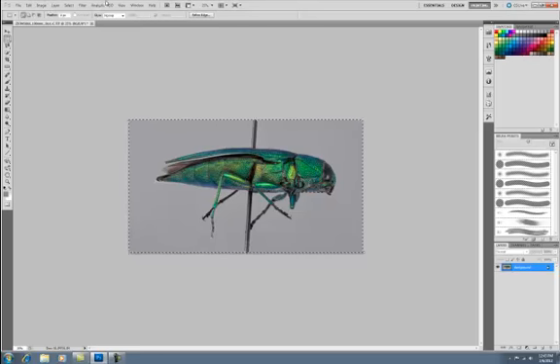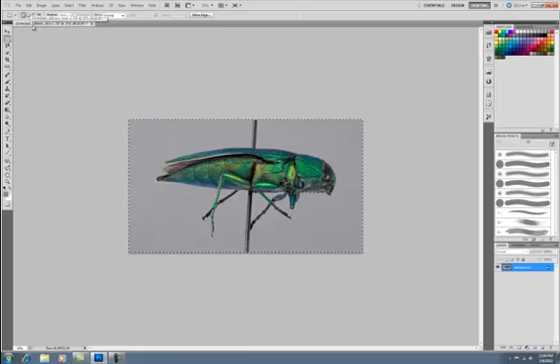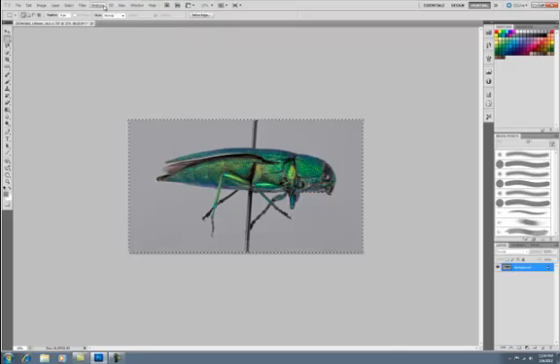So now I'm going to set the measurement to scale so that we can set an accurate scale bar. So I'm going to Analysis, Set Measurement Scale, and then in the file name I have already saved the lens and magnification information, which is necessary to set it to scale. So set measurement scale, and then I used the 5D camera. The lens was 100 millimeters and the magnification was 1:1. So I'm going to select that. Now we can set an accurate scale marker.